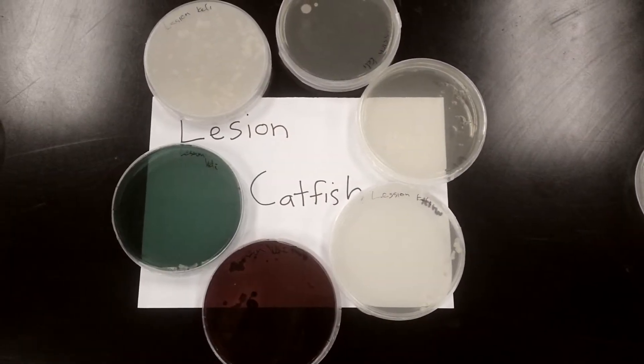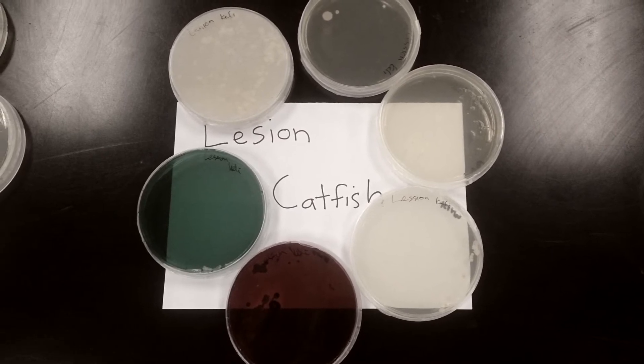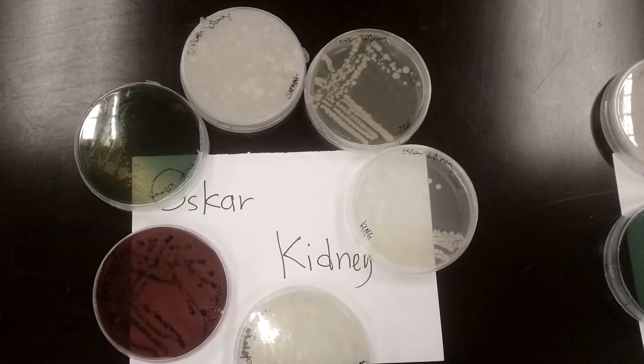And then this is the result that came out from the incubator.